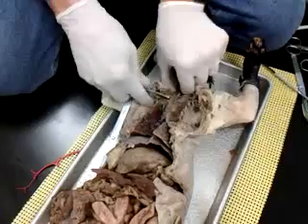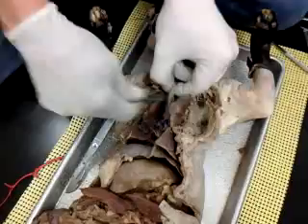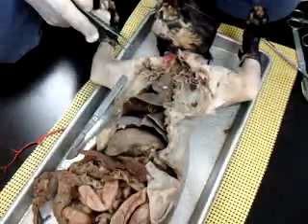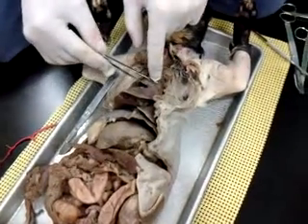All right, you can see the trachea. It looks like a vacuum cleaner hose right here. That's the trachea. Going down to the lungs, these are the lungs. The serous membrane is associated with the lungs. Pleural membrane. So this attached to the outside of the lung, what would you call that?